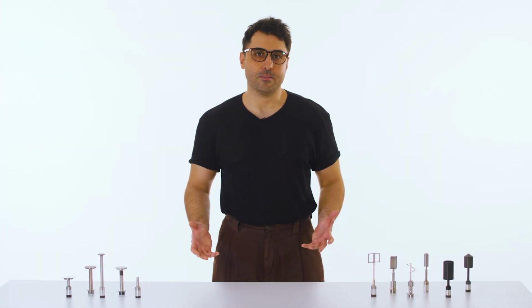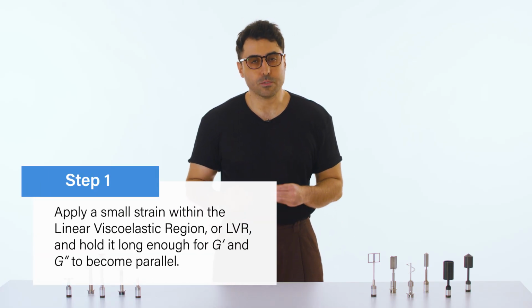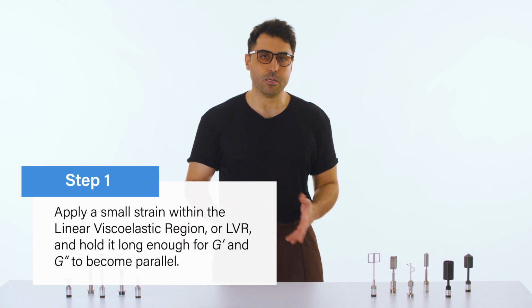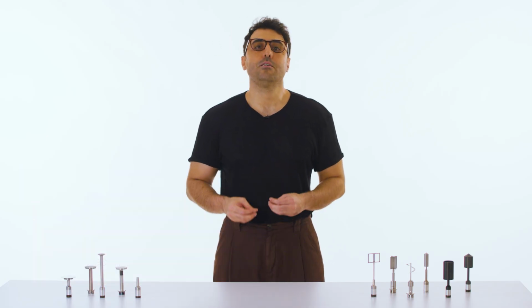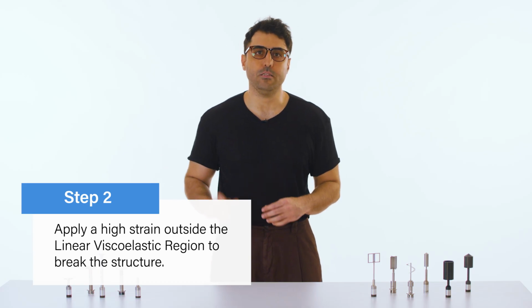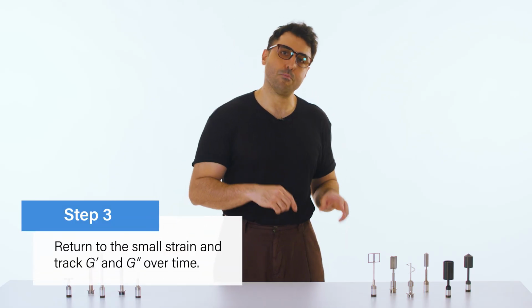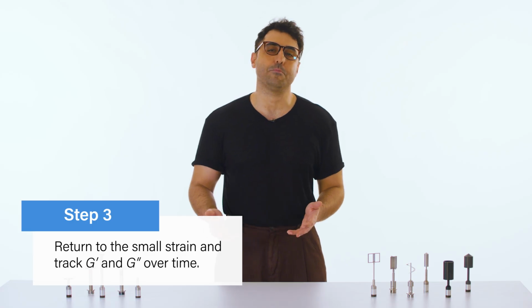In oscillation, the idea is similar. Step 1, apply a small strain within the linear viscoelastic region, or LVR, and hold it long enough for G' and G" to become parallel. Step 2, apply a higher strain outside the linear viscoelastic region to break the structure. Step 3, return to the small strain and track G' and G" over time.